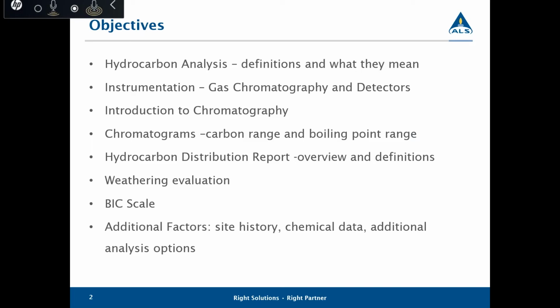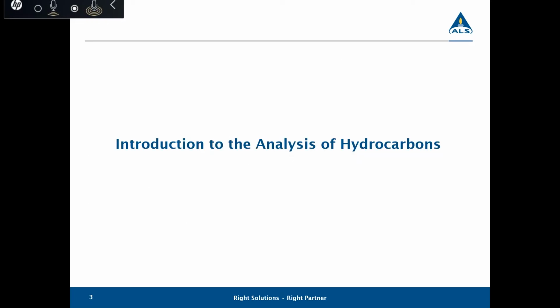We'll discuss the BIC scale, and we'll also look at additional factors like site history, chemical data, and any other options which are open for the analysis.